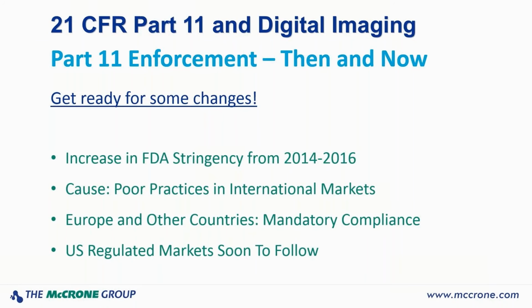Luckily, PAXit software develops as fast as the expectations of the markets it serves. As we move through the quick demonstration, you will see the specific tools PAXit employs to secure your digital images while maintaining enough flexibility to perform all other standard imaging tasks in your workflow. So let's get started.